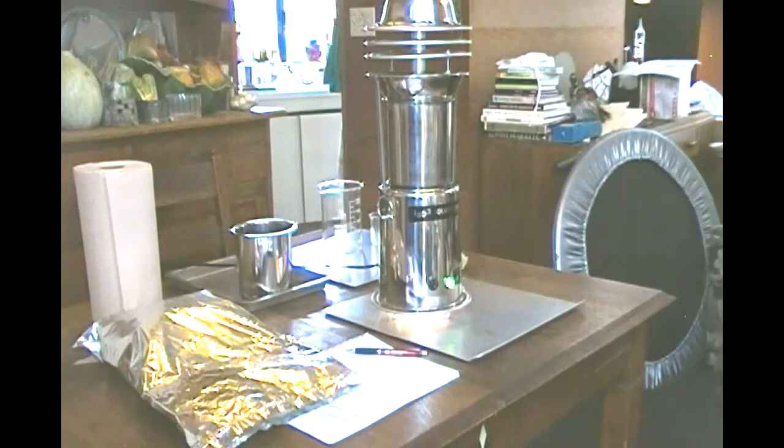So generally what I like to do, especially for whole plant oil, is set this up one day, let it sit for 24 hours, come back the next day, and then extract and complete the process, knowing that in that 24 hours you have virtually everything that was in the plant. So what we do now is we're just going to let this sit for 24 hours, and then we will come to the next step of the process. So it's been 24 hours. Why does time fly?